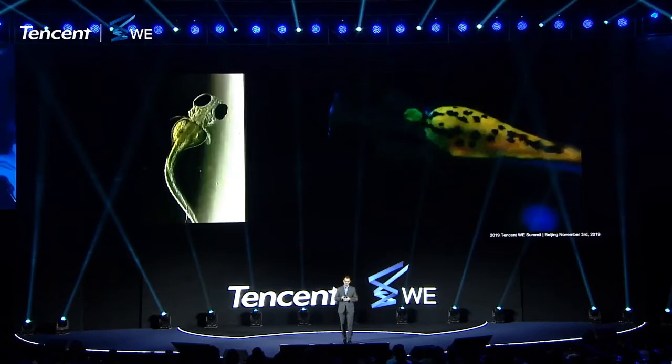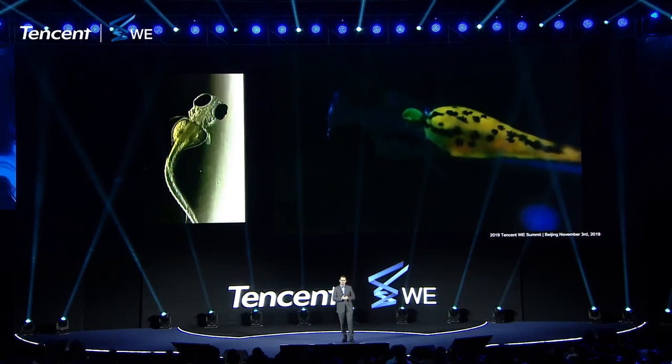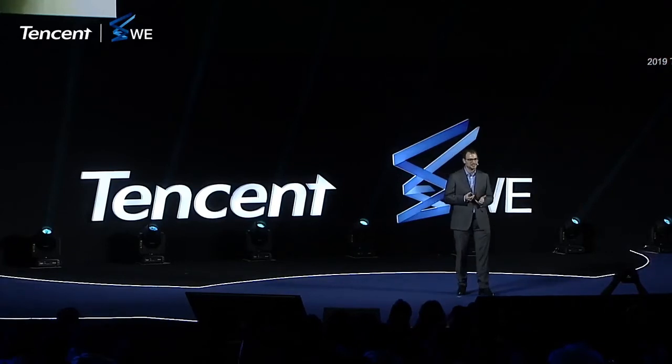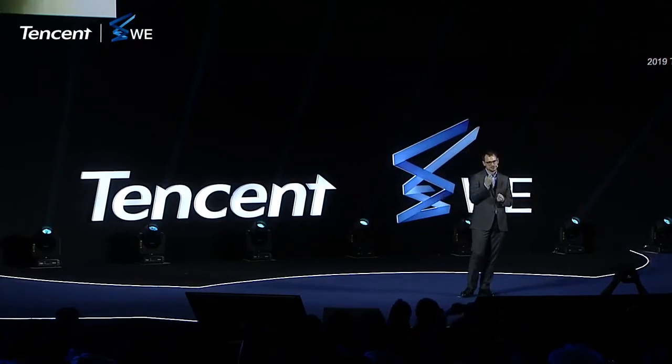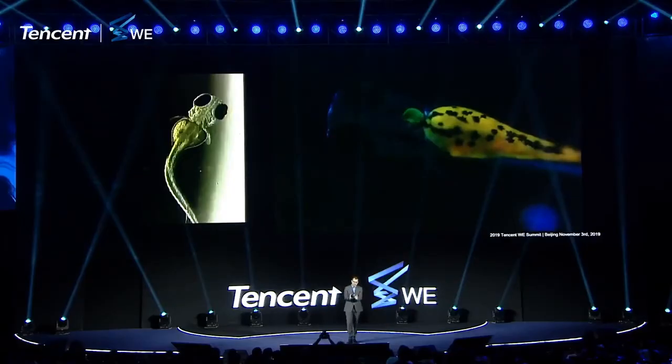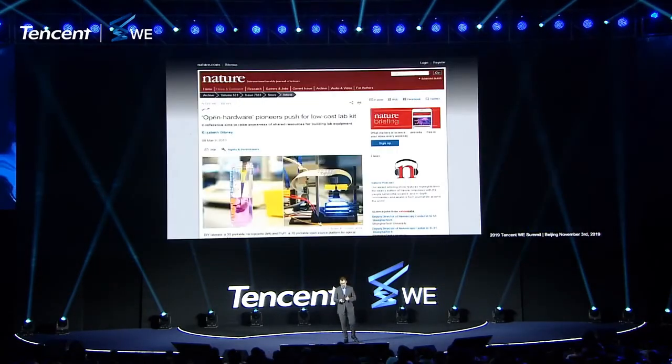So here you see our friend the zebrafish again, 2 examples. Here's the video. So on the right, what we can see there is the zebrafish, transparent as I pointed out, and the thing that's moving, that's the heart. So this heart is expressing a fluorescent protein, and it lets us visualize the contractions of the 2 chambers. It's a fish, so it's got 2, not 4. And you can imagine this becomes immediately useful if you, for example, want to study circulatory function. Oops. OK, the other video didn't play.